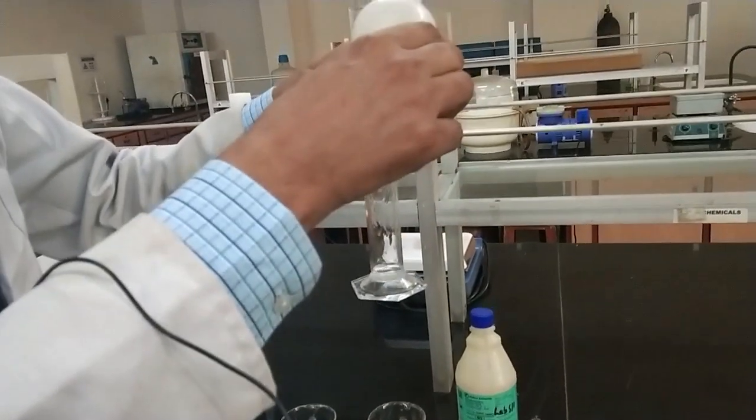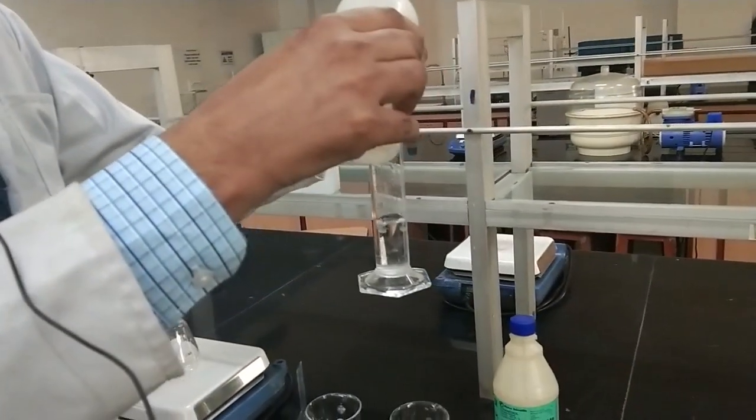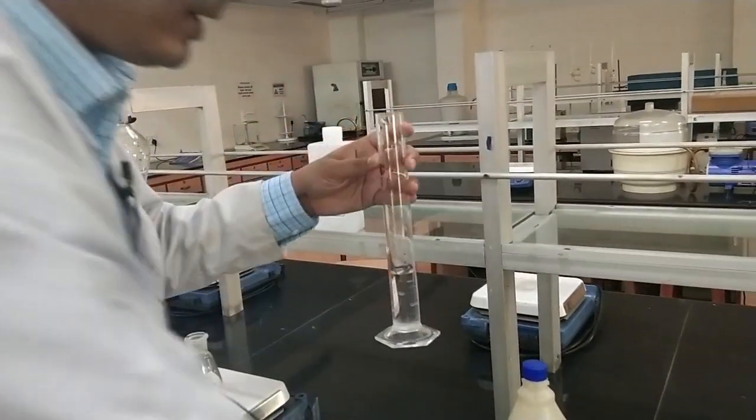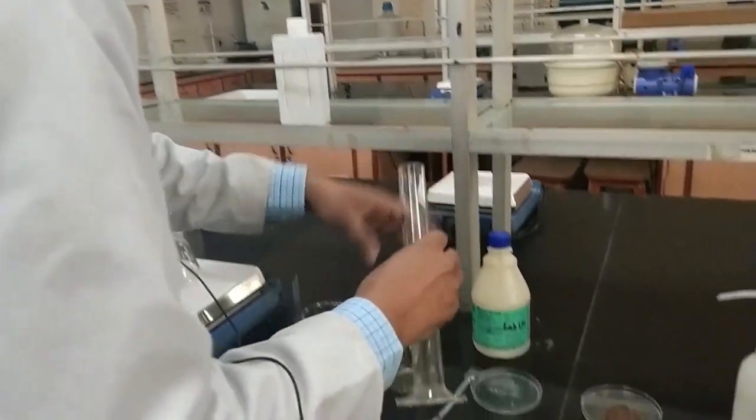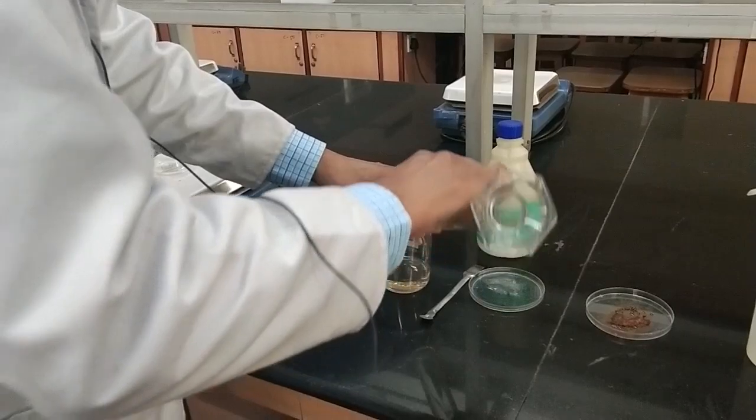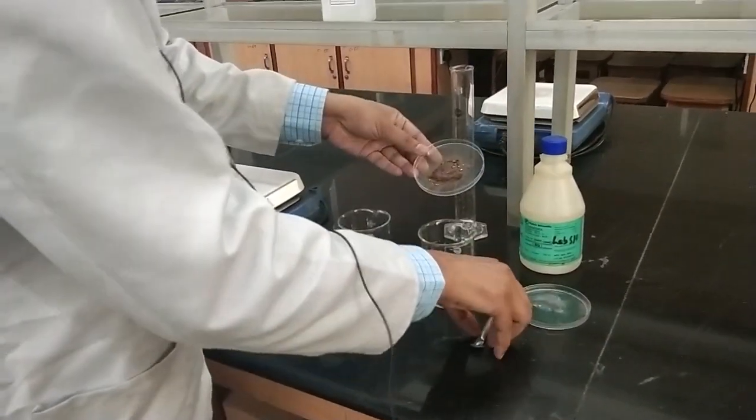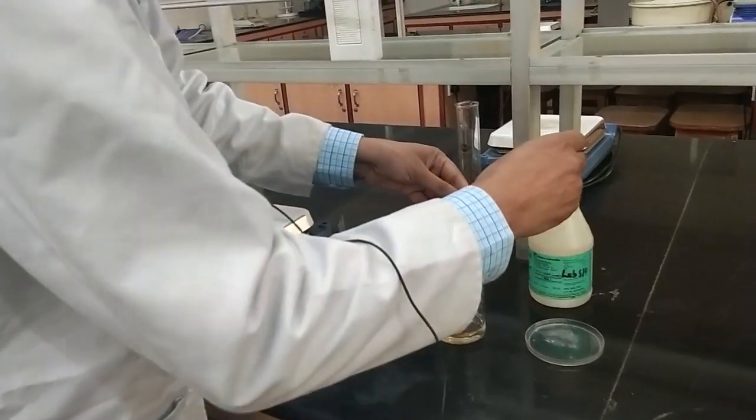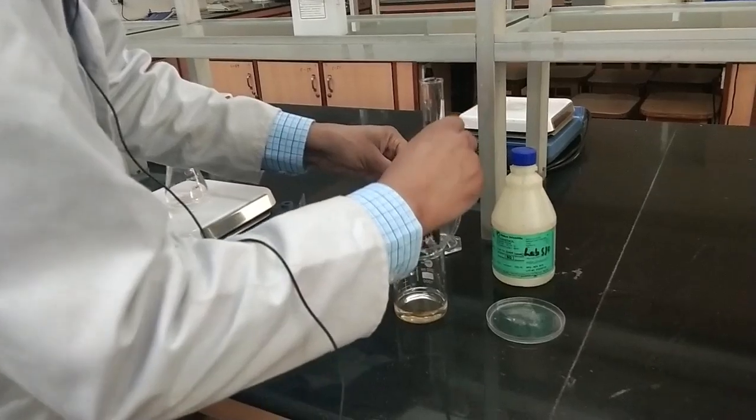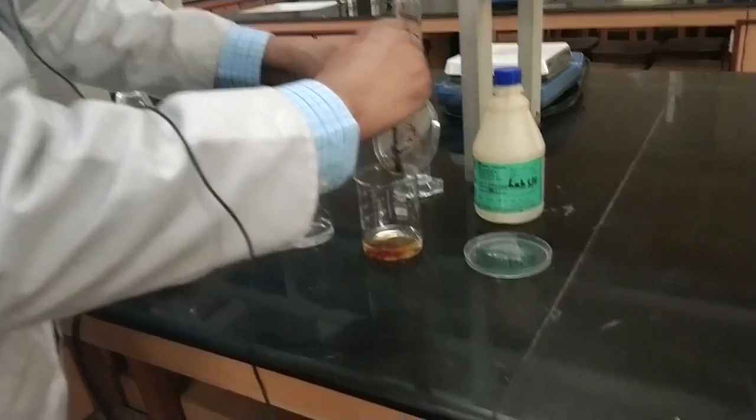While it is going to get solubilized, we will make iron chloride solution. We are measuring 40 milliliter of distilled water and we are going to add already measured iron chloride. This will make 0.01 molar solution of iron 3 chloride.